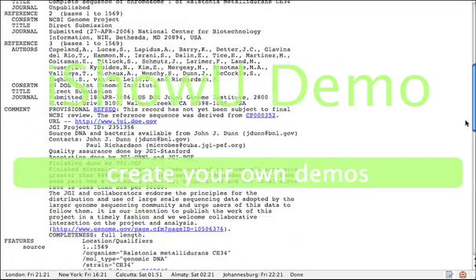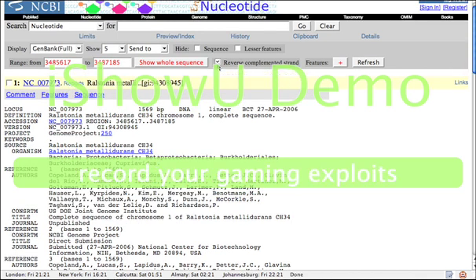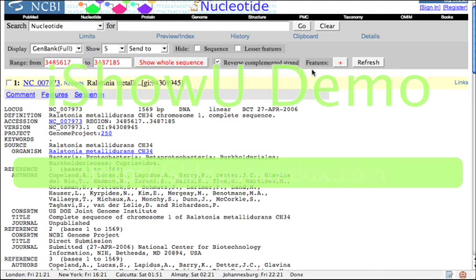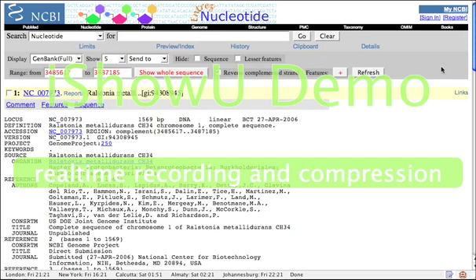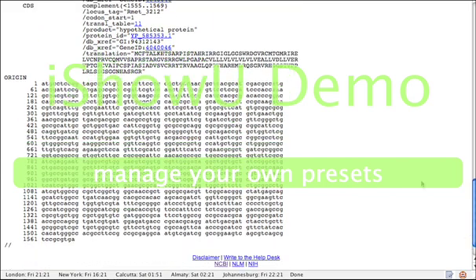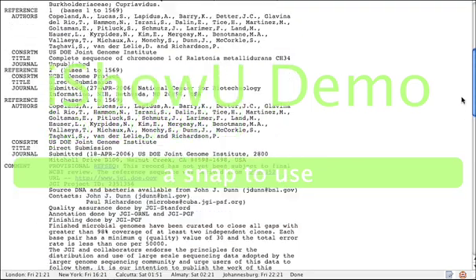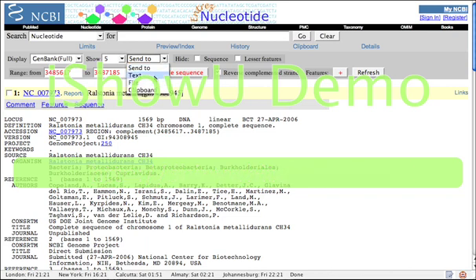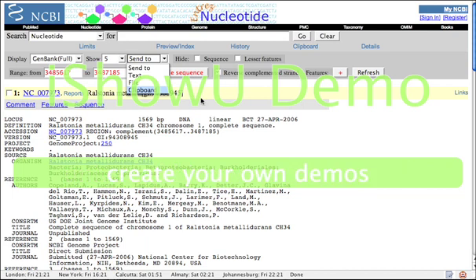And that's the final feature we will explore today. If we just select Reverse Complement and click Refresh, then go all the way down, we can see that we now have the ORF that we're interested in. We can send this entry to a file, to text, or to the clipboard and do further processing for cloning and primer design purposes.